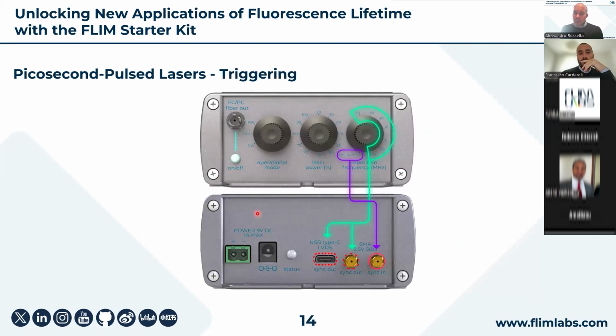Diving into a more specific function of our lasers, since we've talked about the sync signal, these lasers have an internal oscillator.